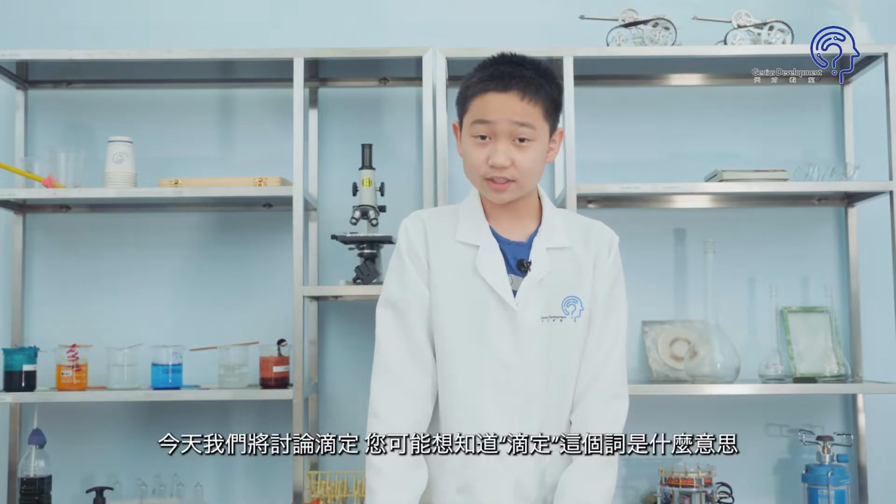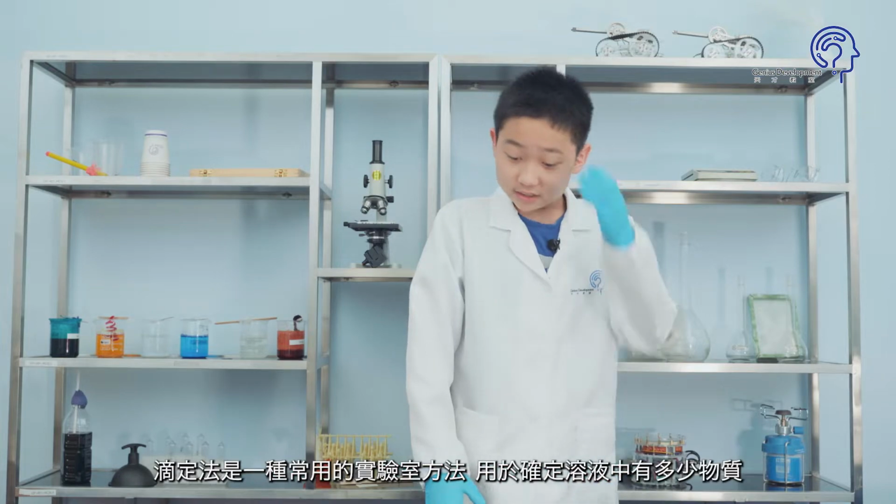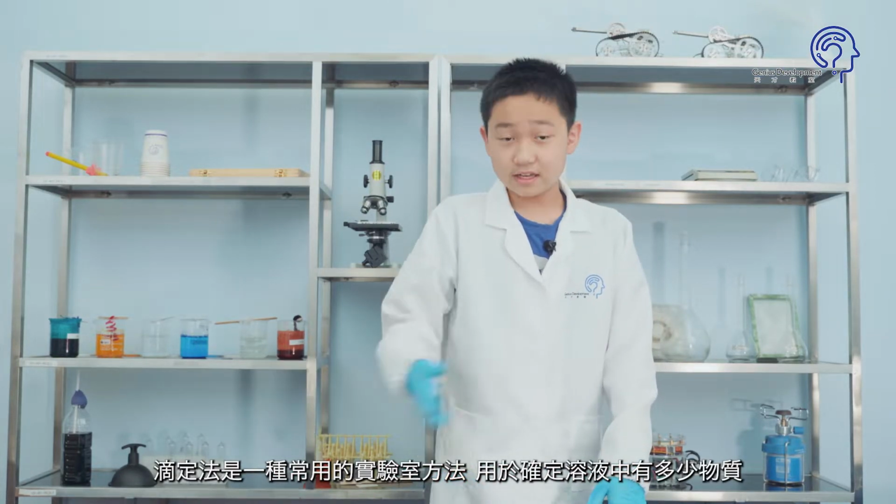Today we're talking about titration. But without any further ado, let's jump right in. Well, you must be wondering what this word titration actually means. Actually, it's just a common laboratory method of determining how much something is inside a solution.